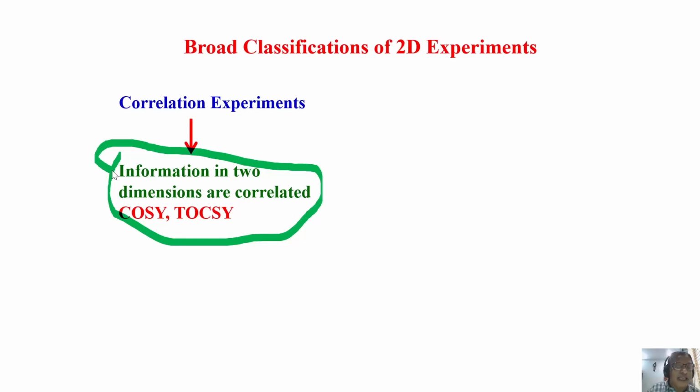Let us say I have a bunch of peaks here, and this proton may be experiencing coupling with different types of other nuclei surrounding it or coupled to it through covalent bond. Now, how do I know what is the coupling strength, which is this immediate coupled partner, which is this coupled one 2 bonds away? Which proton is coupled 3 bonds away? I have to do the experiment.